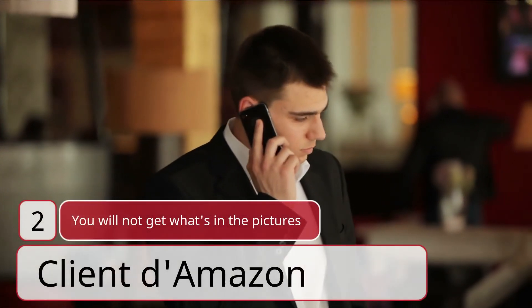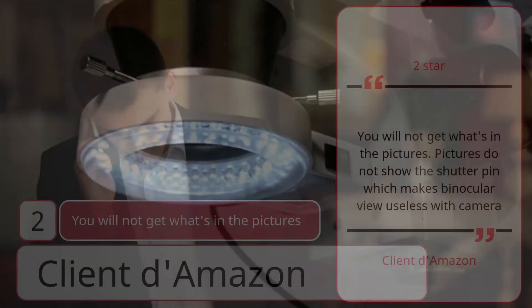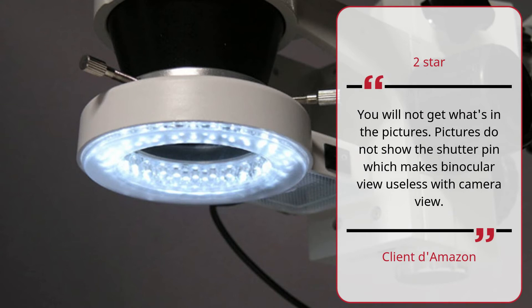Number 2: You will not get what's in the pictures — Client Amazon, 2 stars. You will not get what's in the pictures. Pictures do not show the shutter pin, which makes binocular view useless with camera view.